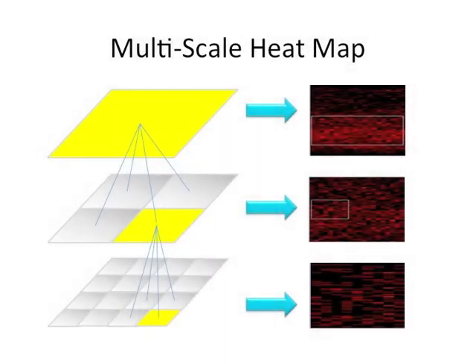We can use multiple scales to measure the values of gene expressions and build scale linking in TCGA Analyzer. For example, at the first level, we see the heat map of all genes whose measured value falls into the 0 to 100 range. At the second level, we see the heat map of all genes whose measured value falls into the 25 to 50 range. And at the third level, we see the heat map of all the genes whose measured value falls into the 25 to 37.5 range. In this way, researchers can observe patterns in different levels.